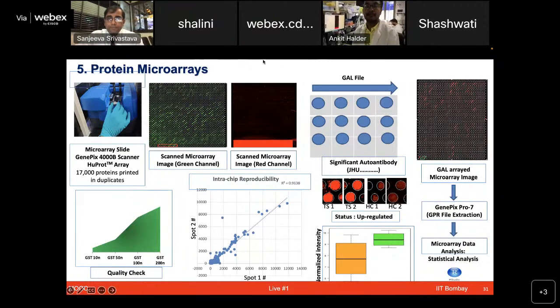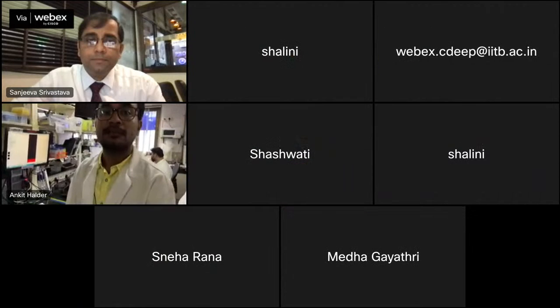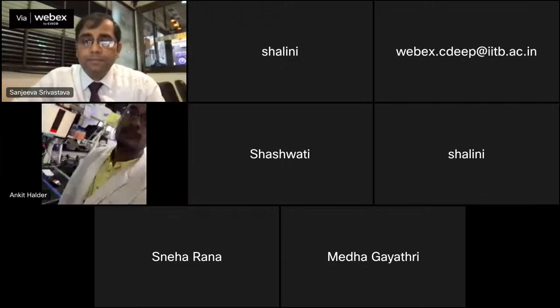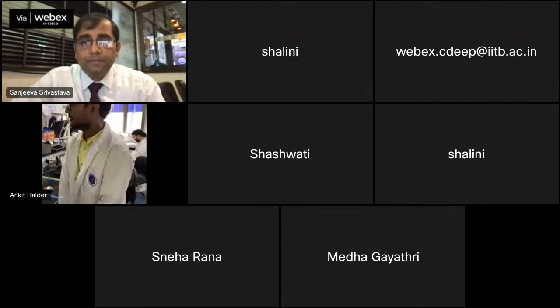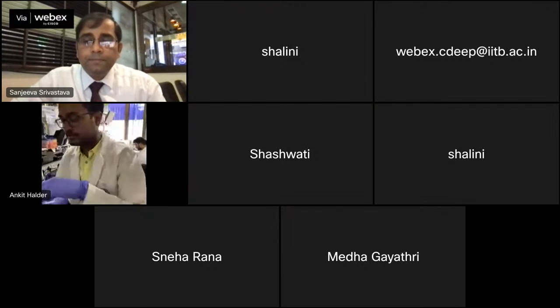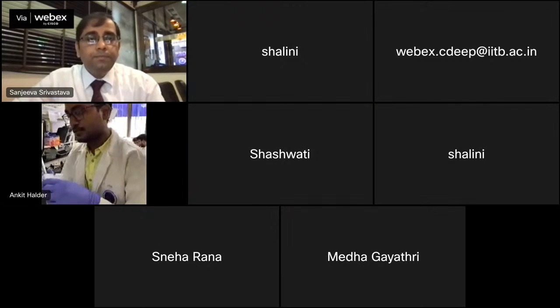Hello everyone, my name is Arko. I'm a PhD student of Professor Sanjeeva Srivastava. Right now I'm doing microarray data analysis. Now I'm going to show you the microarray scanner, how we usually scan the slides. Just now, sir gave the idea regarding the microarrays, so how the microarray chip looks like.